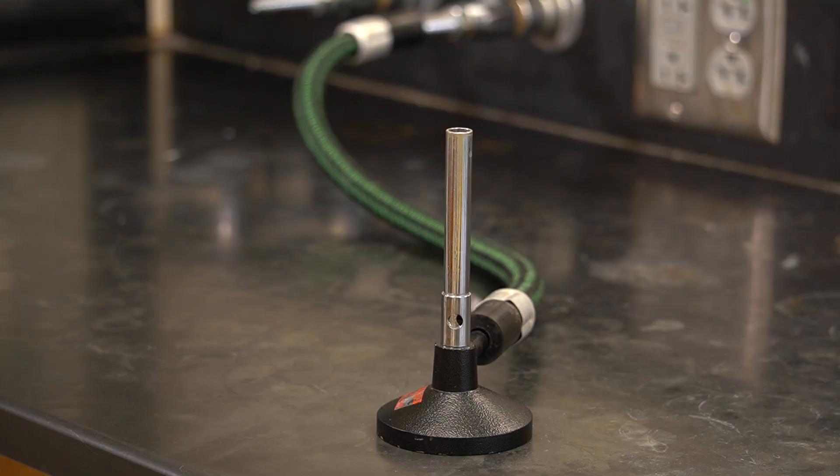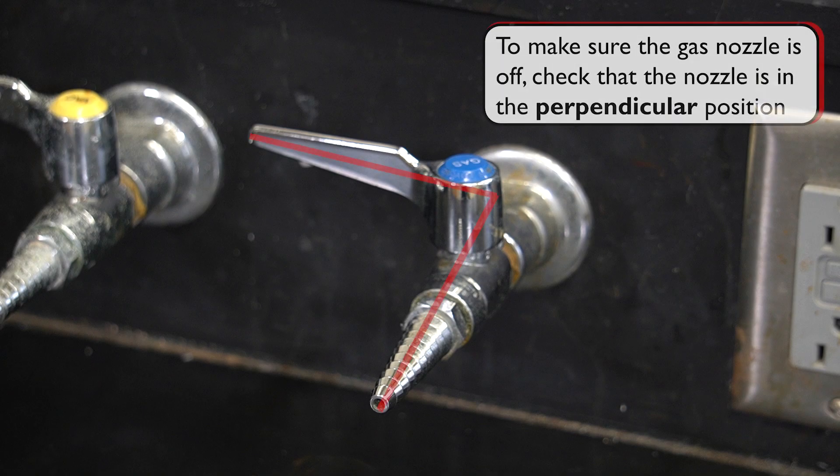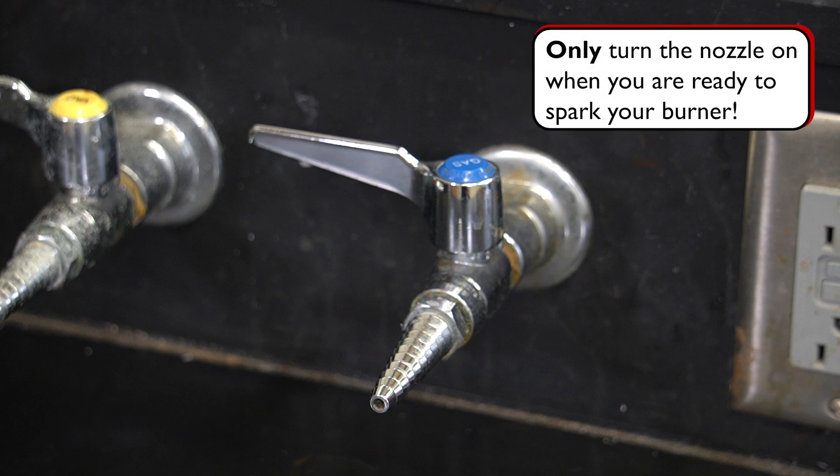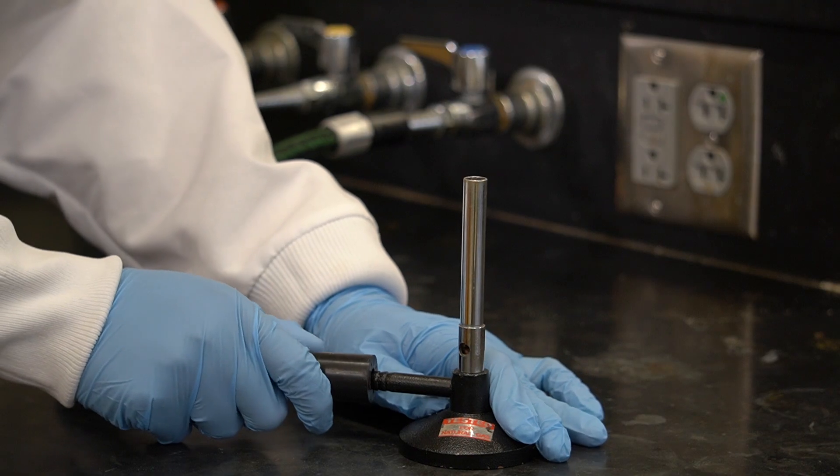Now, let's start the assembly of the Bunsen burner. First, we will want to check the gas nozzle. Anytime a Bunsen burner is not in use, we want to make sure that the gas nozzle is off and no gas is leaking into the room. We do not want to turn on the nozzle until we are ready to spark our Bunsen burner. Connect the tubing from the burner's gas inlet to the gas nozzle.